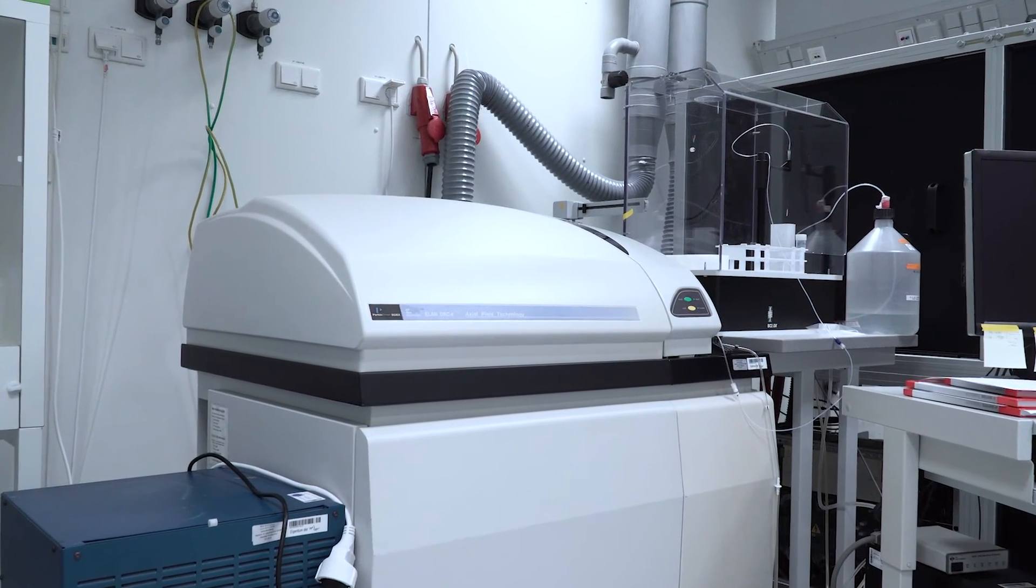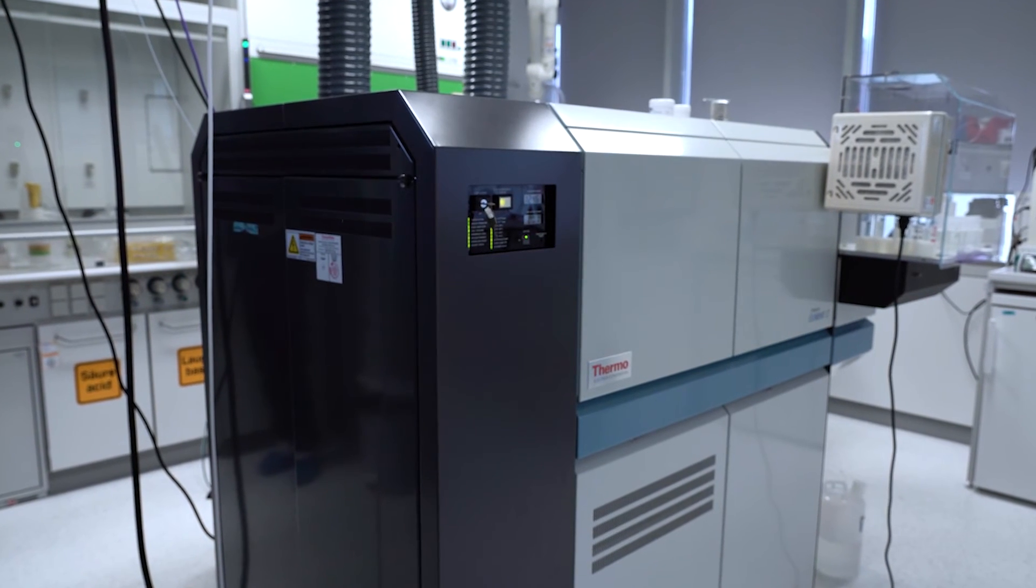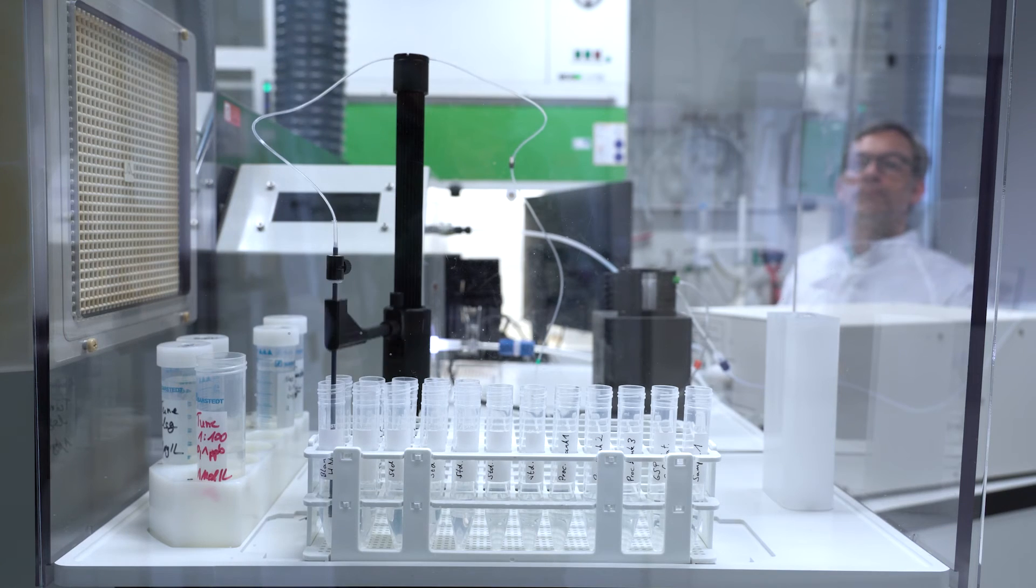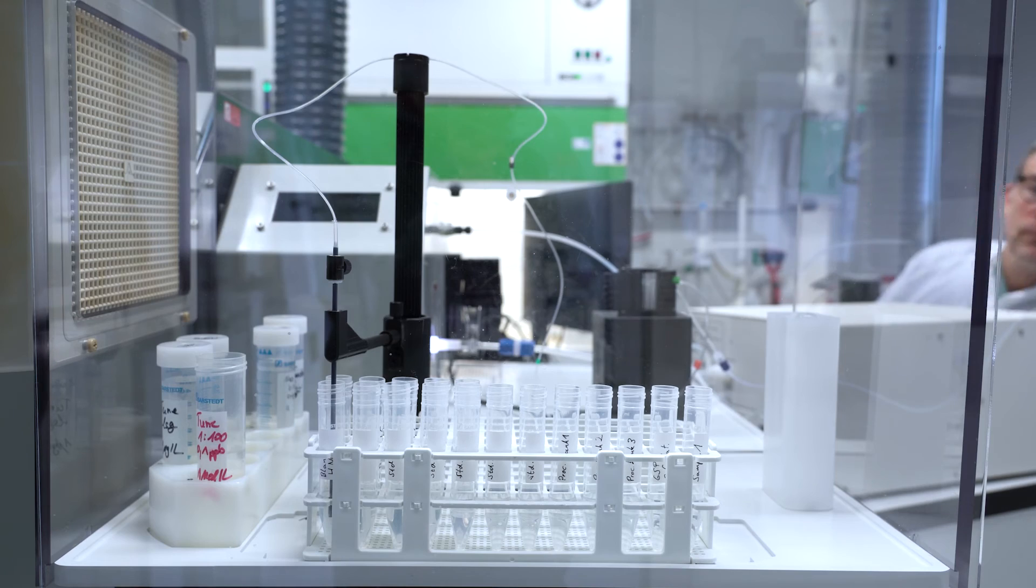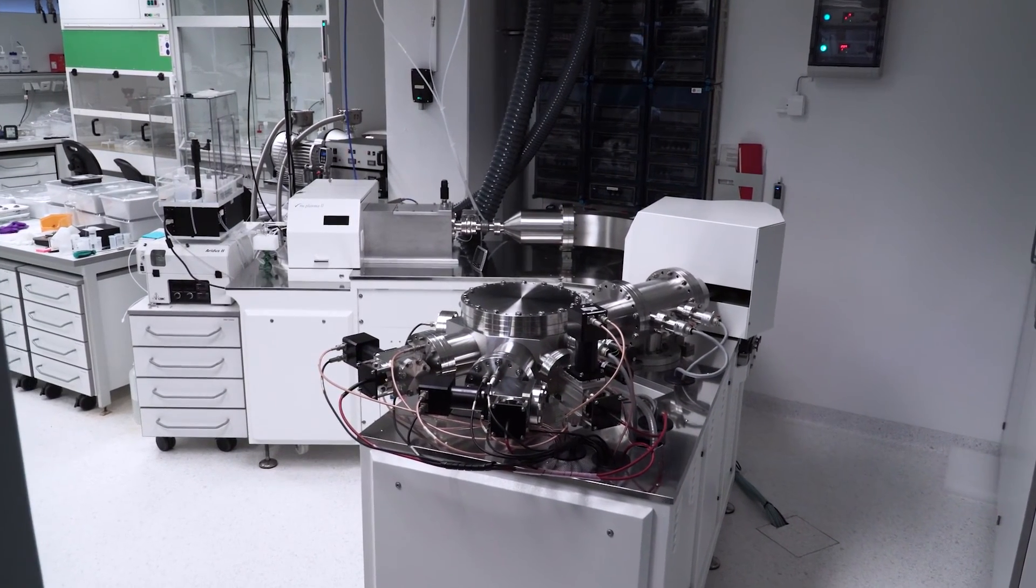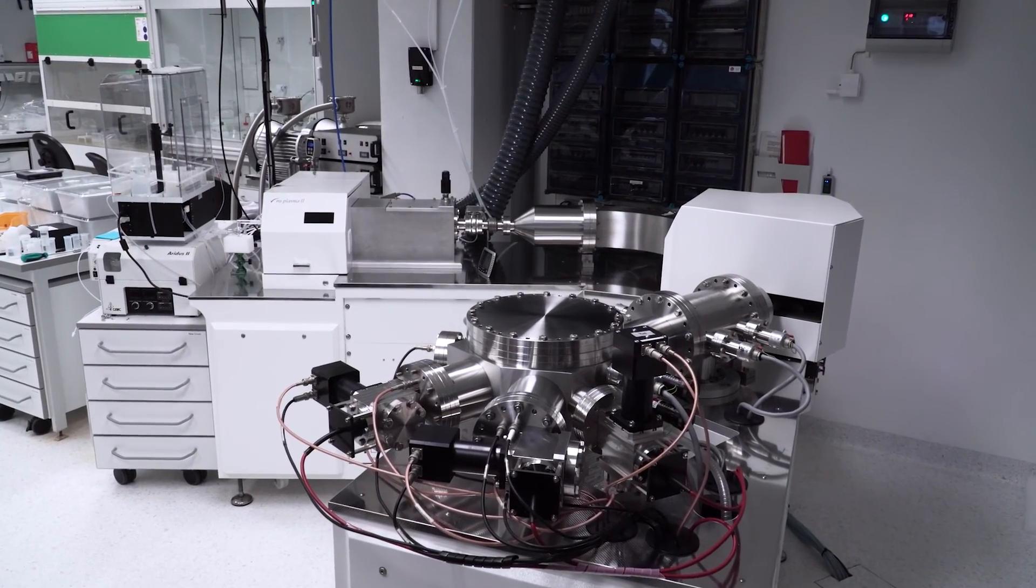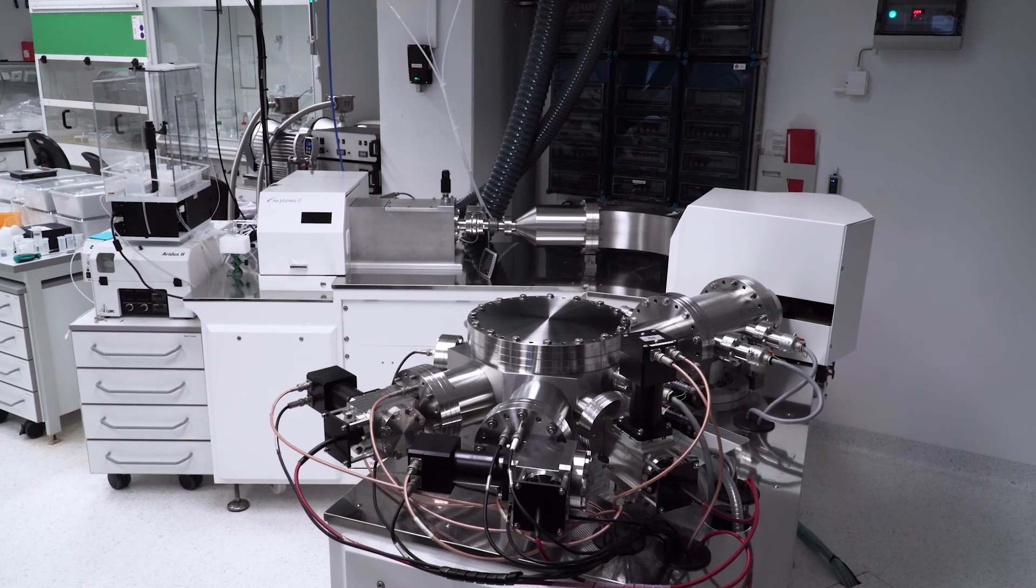Quadrupole ICP-MS and high-resolution ICP-MS are used to measure basically all trace elements and some isotope ratios. The most precise measurement of isotope ratios can be done with a multi-collector ICP-MS like this instrument.